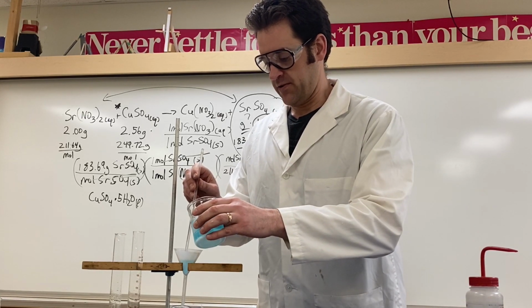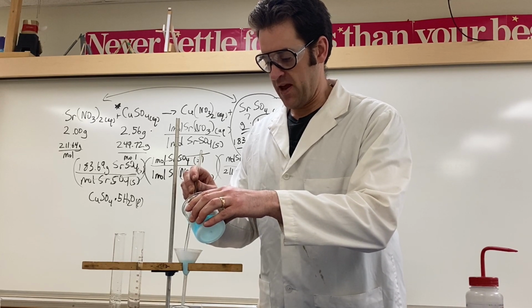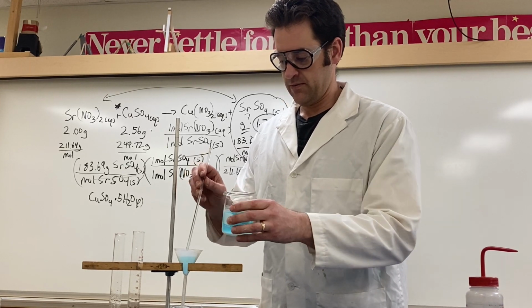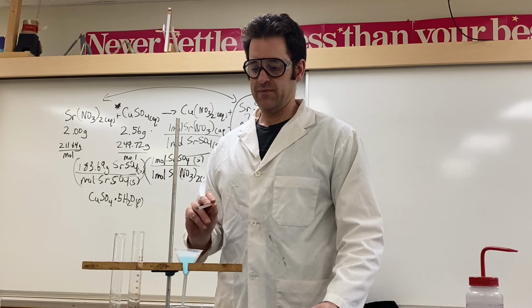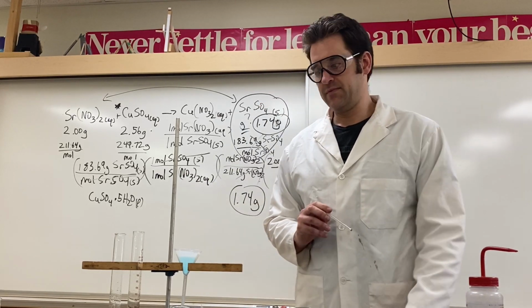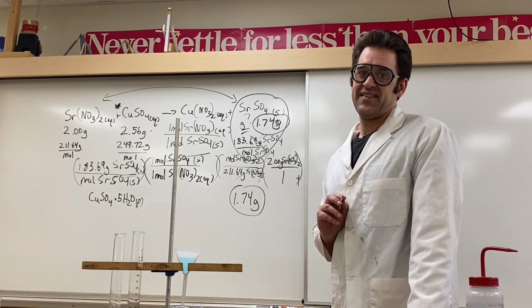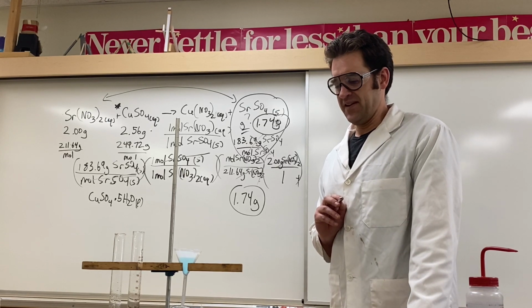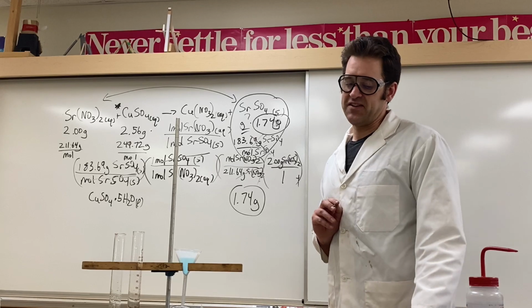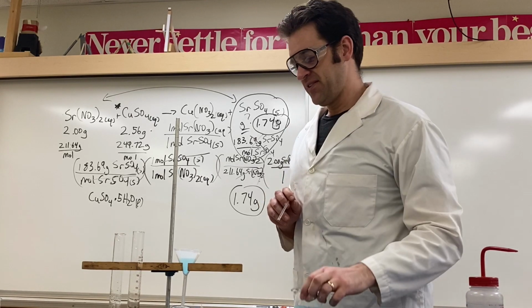Okay, here we go. Round some more. Now, I will be fast forwarding this when I'm editing because this is a boring part. Yeah, usually the filtration takes the bulk of the class period. If you were here, Chem Stars, you would be doing a quiz while this painful process of filtration occurs. But with the magic of digital ed, this is going to take all day, Z-dawg. Look at all of this to do.